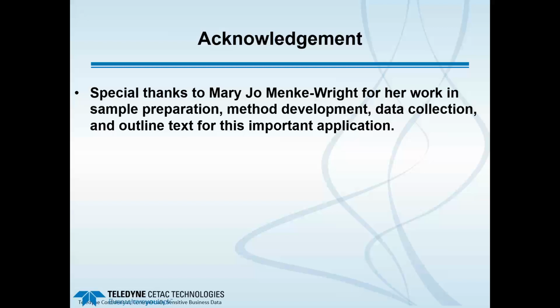So an acknowledgement, special thanks to Mary Jo Menke-Wright for her work on the sample preparation, method development, data collection, and outline text for this important application. As you can see, she did a lot of work and made sure that she looked at quite a good variety of different food sample types, both beverages and food, and then appropriate NIST food matrices to ensure that we had good recoveries of both major and minor elements.